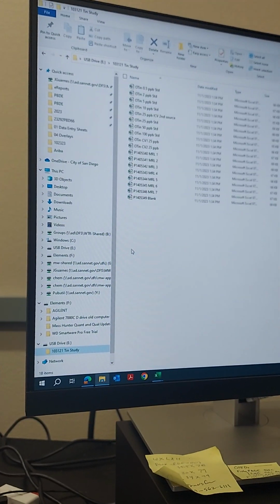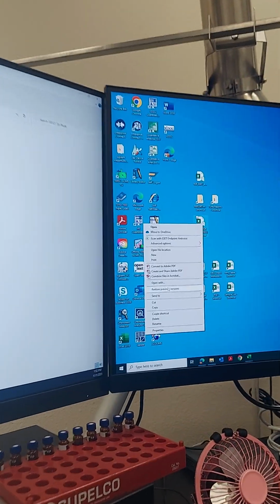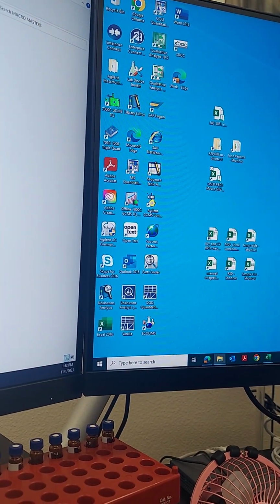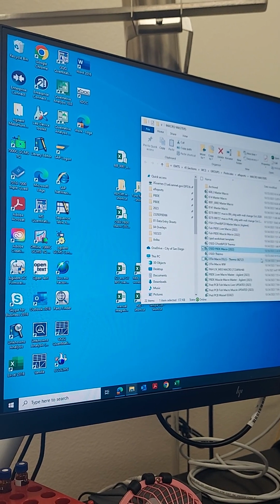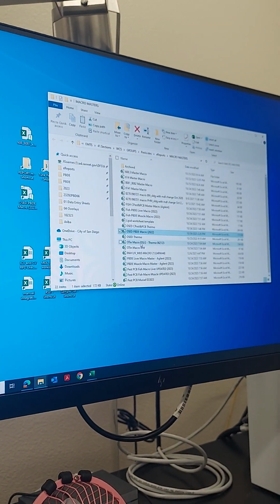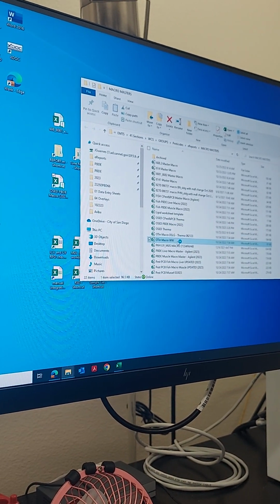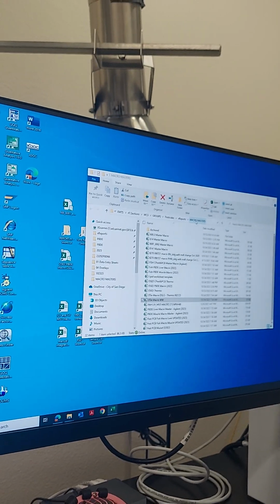So let's get that macro. What do you call this? Offset? Oh no, that one's mine. I used that to get to this folder. Oh. This is called OTN macro WW. Okay. It's pesticides. Yep, pesticides, e-reports, macro master.